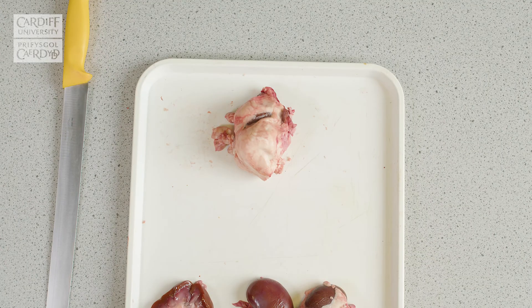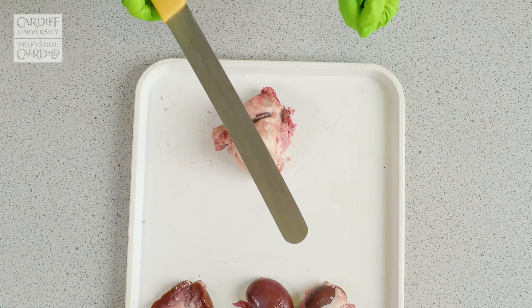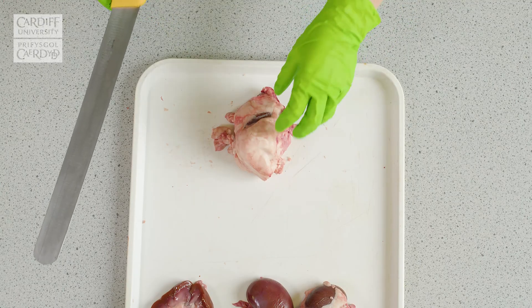We would recommend carrying out this dissection using a knife with a long blade, such as a bread knife, so that the initial dissection can be carried out using a single incision.